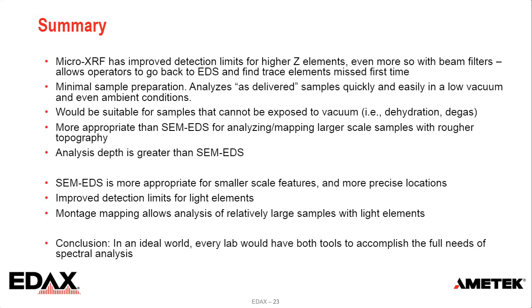Next question is, can Micro-XRF measure multi-layer coating thickness? Yes, it can. We have coating layer measurement software. So with this, you can measure the coating thickness for multiple layers. For a semiconductor sample, you can use this to figure out the layer thickness for different layers. And it also applies to other applications.